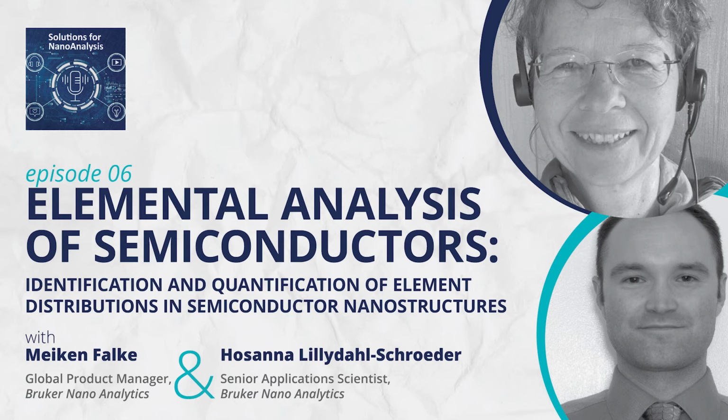The background at a particular energy represents the overlap of all energy losses below this energy. And it's very complicated. And then sitting on top of this complex background is the EELS edge.